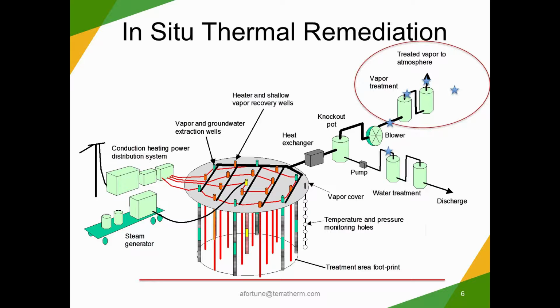This FTIR system was used exclusively to measure vapor. So that's a very common question that I get: can we use this system to monitor liquids in the wastewater treatment side of the treatment train? And the short answer is no. This system that we have is customized to monitor vapor. That being said, there could be a system constructed to monitor the liquid system, but the system that we're talking about today is primarily for vapors.